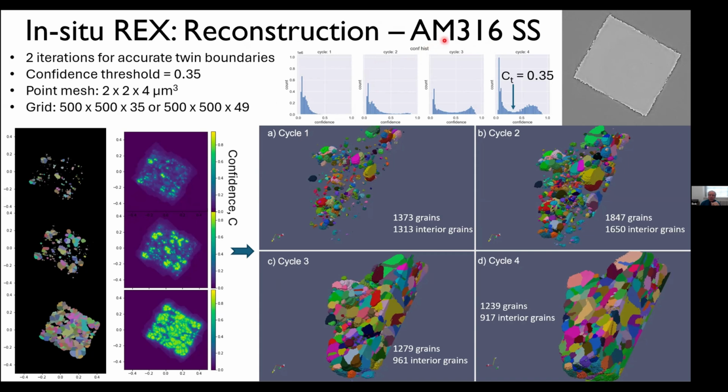When you do laser powder bed fusion, you typically wind up with a very complex, I'll say messy looking microstructure. And it's a state of the material which doesn't allow the standard straightforward HEDM reconstruction. So these images show successive anneal states of this sample. And initially, actually after one anneal cycle, we see a sparse, pretty random looking distribution of grains.